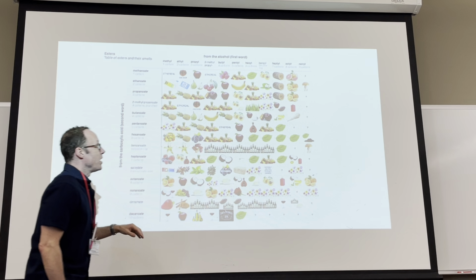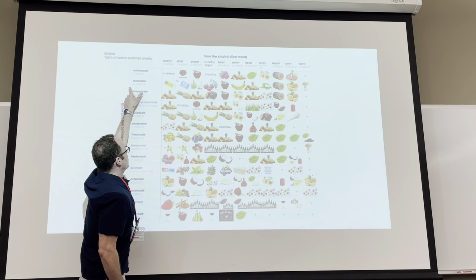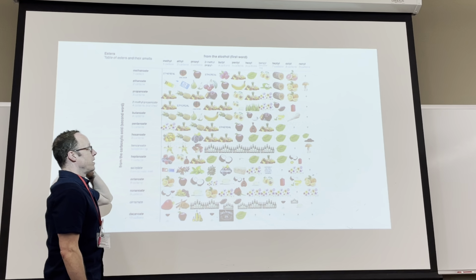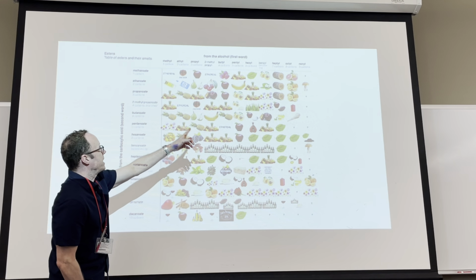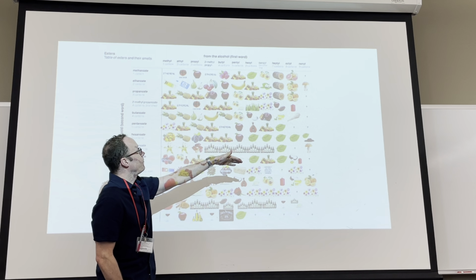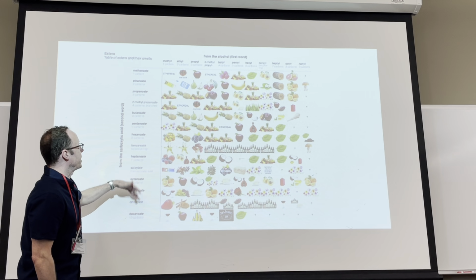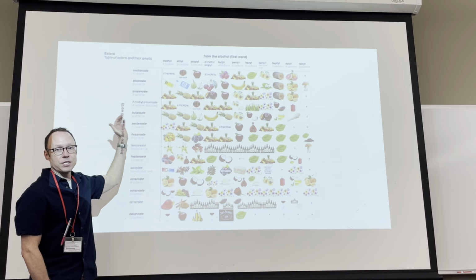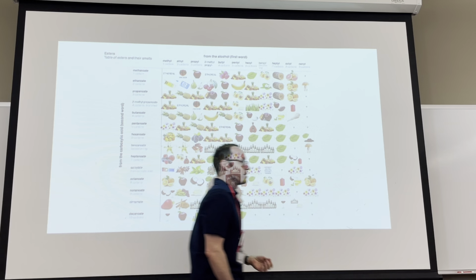Anyway, the only thing we're really concerned about in this grid is the 2-carbon row, because you're all going to be using the same carboxylic acid, namely acetic acid. That's what you would expect yours to smell like. Along the x-axis you have all the different alcohols that were assigned, and on the y-axis are your carboxylic acids. Since we're all using acetic acid, we're just going to use that second row in terms of what we would expect ours to smell like.